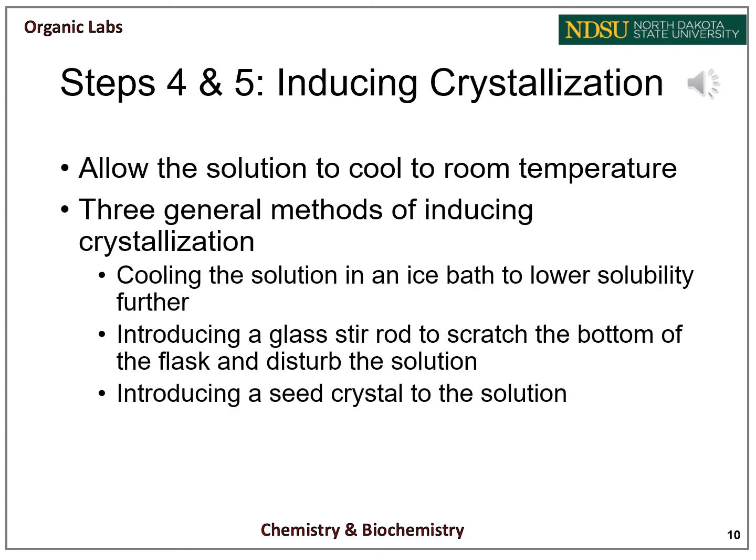Steps 4 and 5, inducing crystallization. First, you want to allow the solution to cool slowly to room temperature, as this will give better crystals. Once allowed to cool to room temperature and if no crystals are present, there are a few things that can be done to induce crystallization.